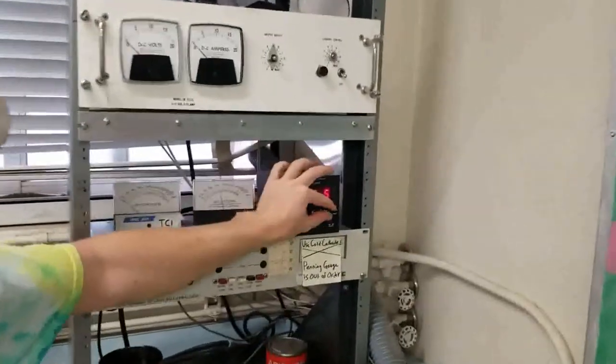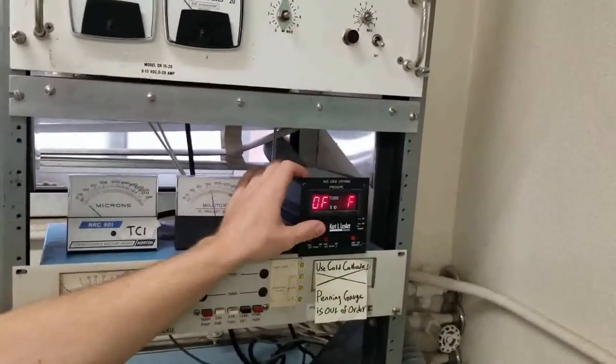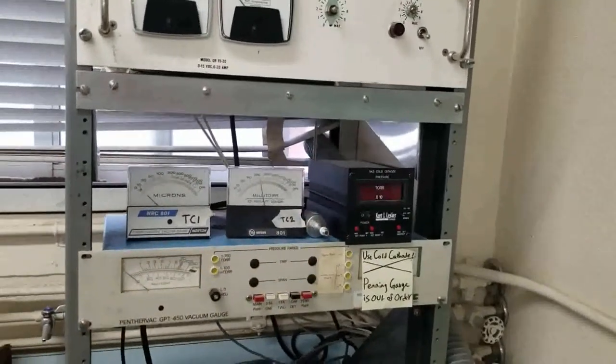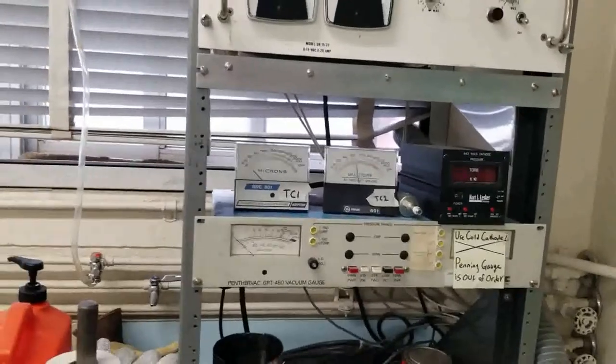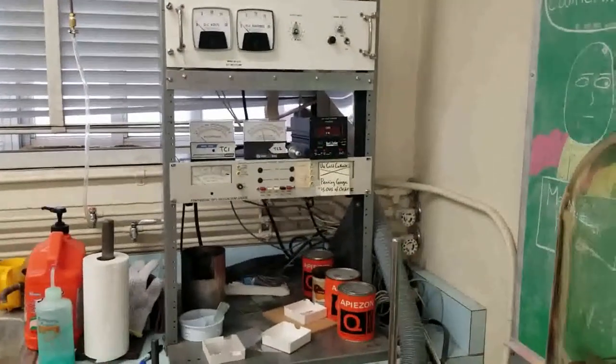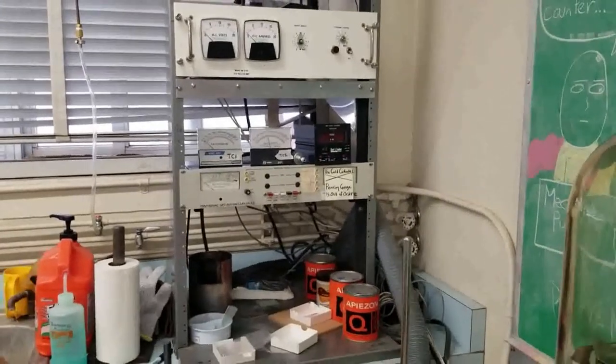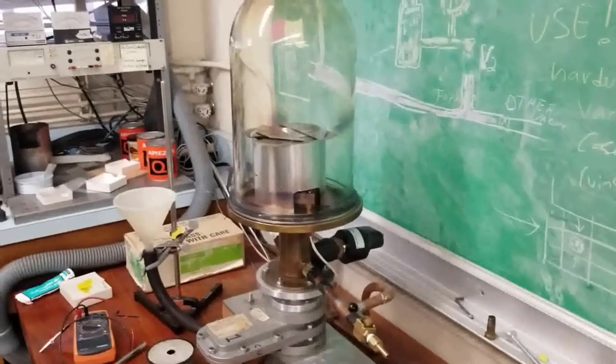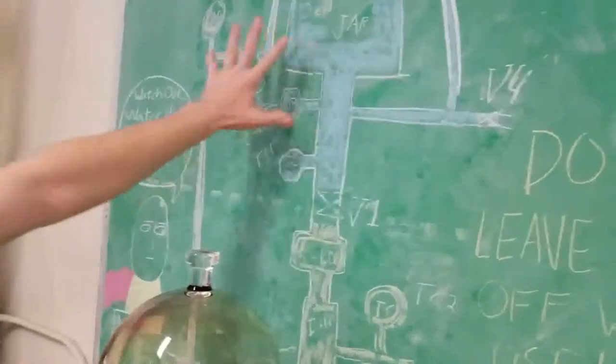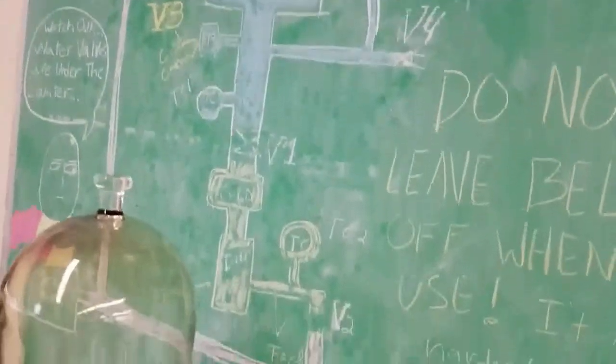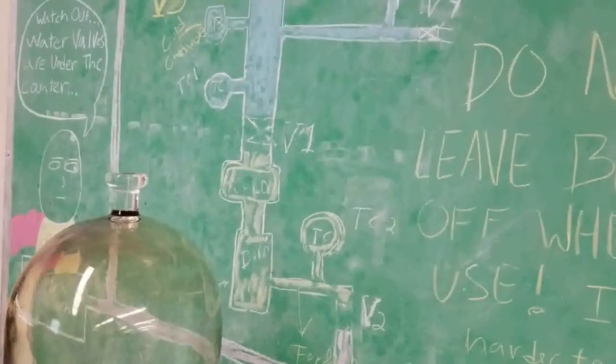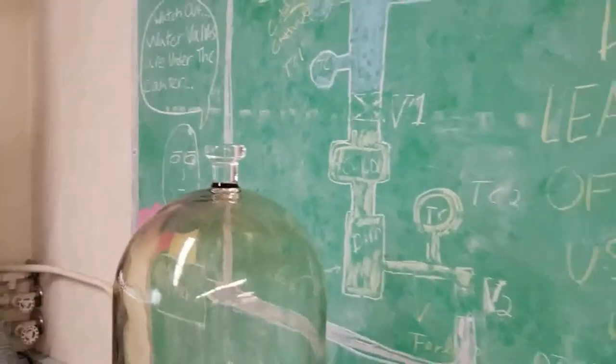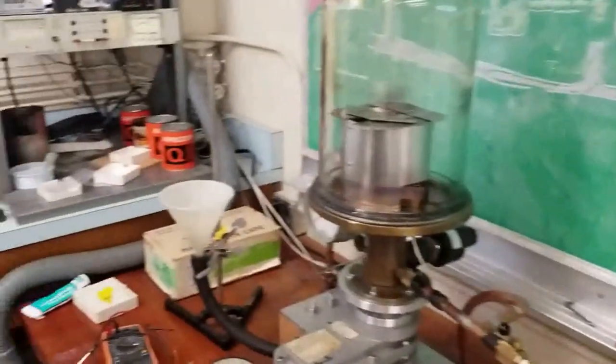So the first thing we do is turn off the cold cathode gauge. Because it will break if we increase the pressure past 10 to the minus 2 torr. So this is millitorr, so that has to be below 10. Good to know. Cold cathode is off. So we want to get this to atmospheric pressure. So the first thing I'm going to do, valve three is already closed. And I want to get this to atmospheric pressure. So all I should have to do is close this valve, isolate V1, and turn on valve four? Yes. But before we do that, just in case something breaks in here, we're going to turn off the diffusion pump too. And I'm going to leave the water on to let it cool down. Because if we leave it hot and we open up some valves, we could still have oil sublimating into the top.